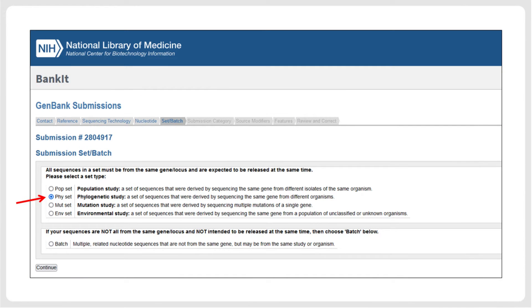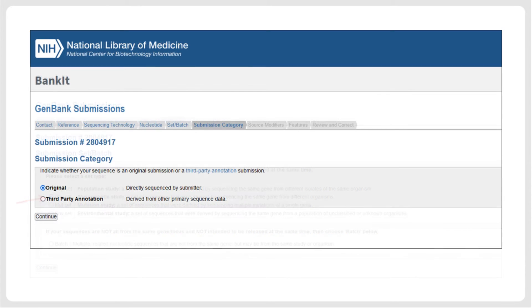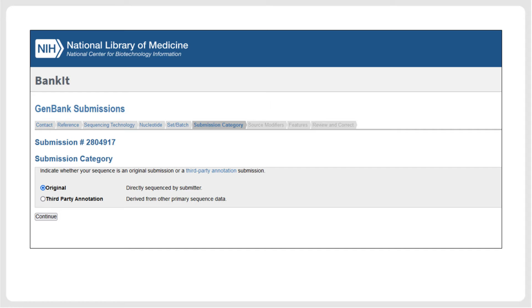Specify that your sequences represent genomic DNA, and upload the FASTA file containing sequences and source modifier metadata. In most taxonomic datasets, specifying that your sequences represent a phylogenetic study will probably be adequate. The sequences we are submitting represent an original submission. Several other pages of the BankIt submission pipeline are equivalent to those of the submission portal, and are therefore not shown here.